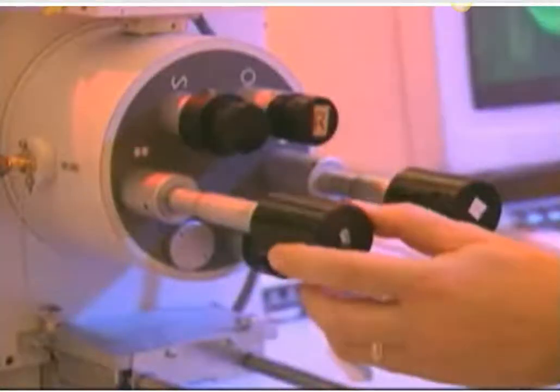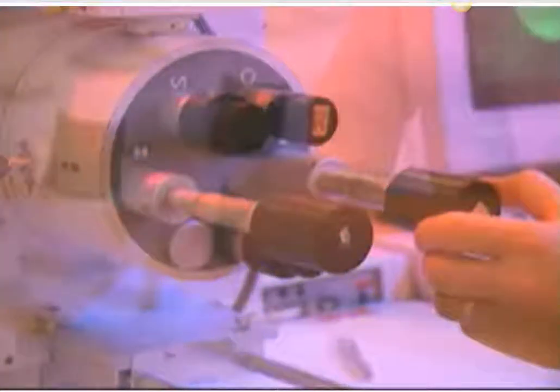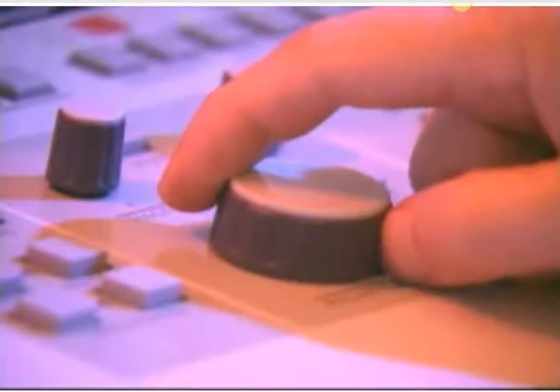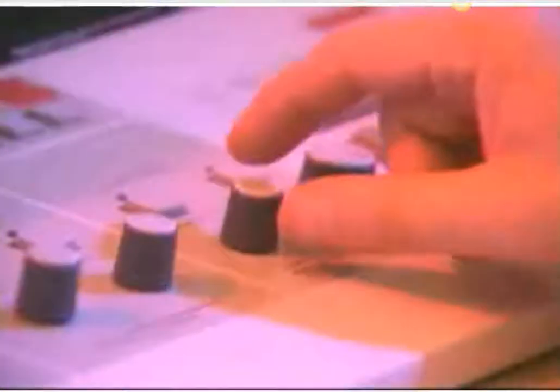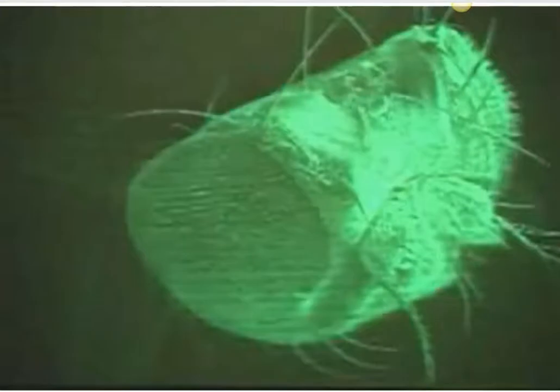The microscope stage is moved by control knobs on the outside of the chamber. Another knob controls the magnification, and another the focus. The image is displayed on a monitor, and while the picture is only in one color, it is nothing short of awesome in its detail.